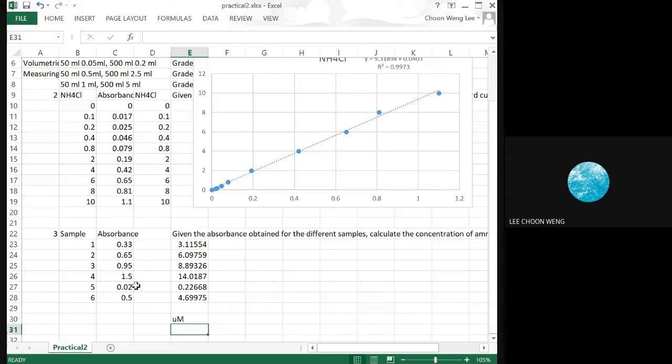Anyone? Anis, do you understand the concentration already, the formula? So anyone knows why there's something wrong with this set of data?